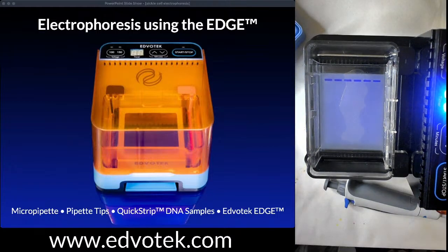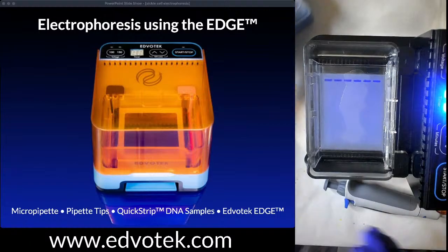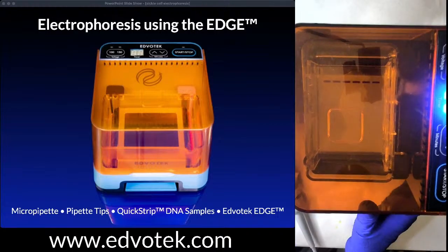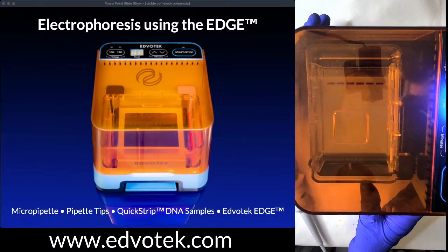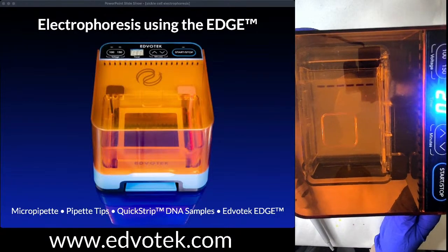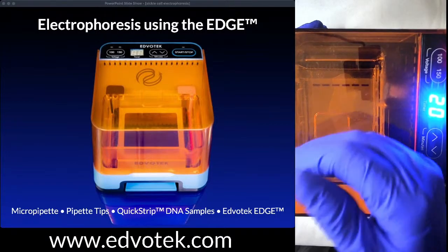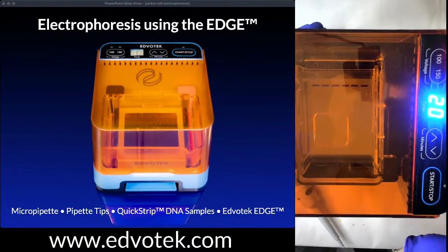So I have the gel loaded. That was easy enough to do. What we do to run the gel is we're going to put our orange cover down. One advantage to our system is that it can only run with a cover on it. You can't turn it on without the cover, because it will not allow you to turn the current on. This basically means that your students can't get into it while it's running and potentially get a little jolt.